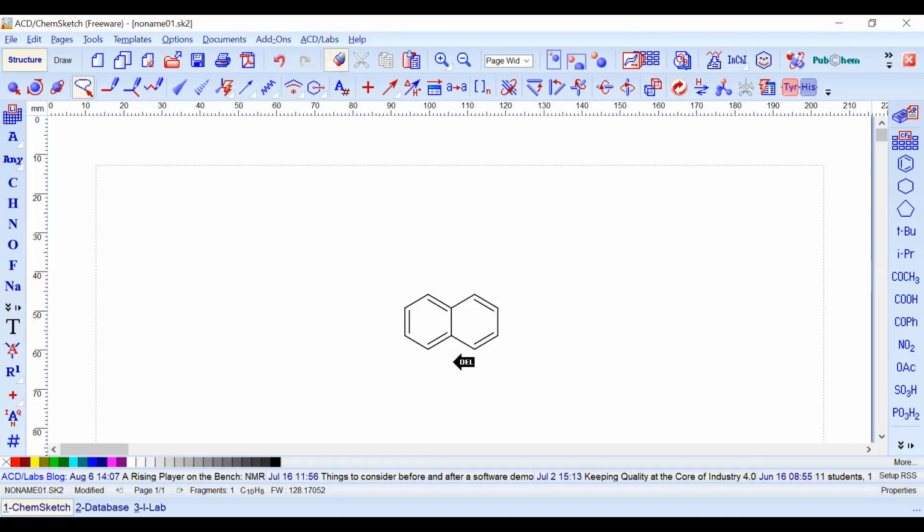How can I do it? Very simple. You just see this delete cursor where I'm moving it. Go to this line which is draw normal. Just click with that one once. Okay, come back. Now when you come back, the cursor will be having a terminal end, that is, the pointer will be having a terminal end only to carbon.